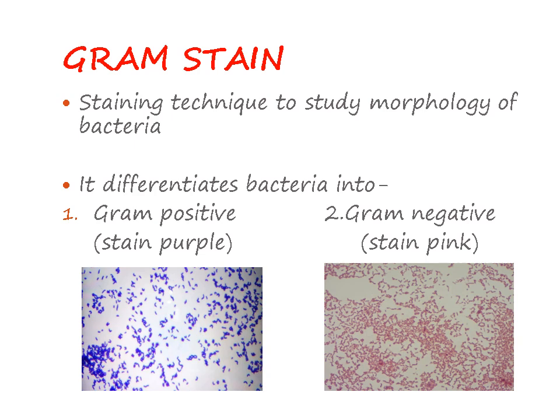Morphology means how the bacteria looks like under a microscope. So it helps us to differentiate the bacteria into two major groups, that is, either they are gram positive or they are gram negative. We call them gram positive if they stain purple using a gram stain. In case they appear pink under the microscope after gram staining, we call them gram negative.